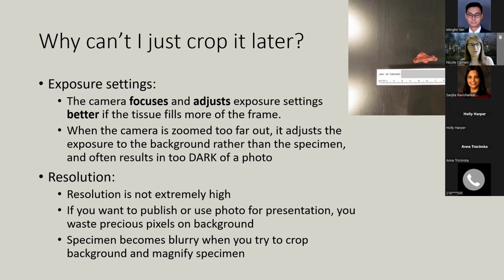Secondly is image resolution. As you know, these cameras are limited by pixel space, by pixel dimensions. The resolution is not infinite; you're composed of these little dots. If you want to publish or use this photograph for presentation, you waste precious pixel space on irrelevant background. Yes, you can crop it, but when you want to print it at 300 DPI at 5 inches, your information is gone and the image becomes blurry. So why waste all that precious pixel space on background? That's why I say crop it now, don't crop it later.